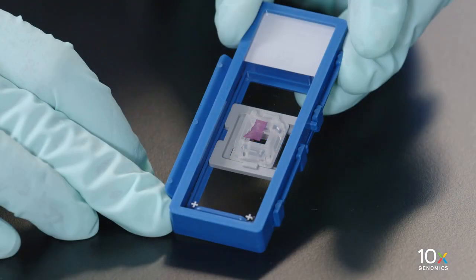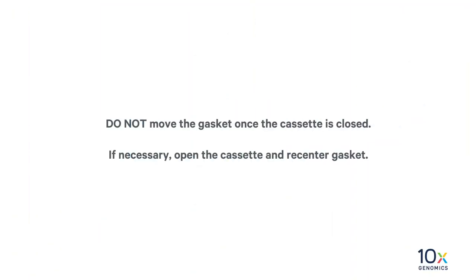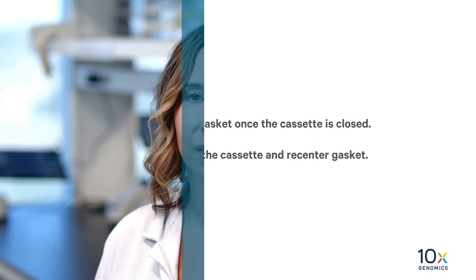Turn the cassette over and verify the Tissue Area of Interest is within the gasket. Do not move the gasket once the cassette is closed. If necessary, open the cassette and recenter the gasket. Next, we will disassemble the Visium Side Assist Tissue Slide Cassette.